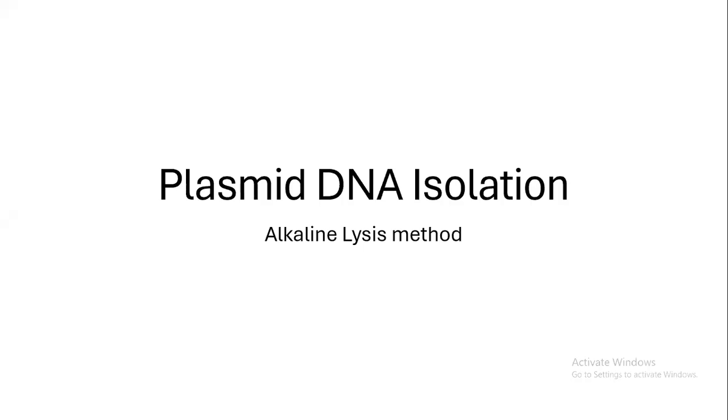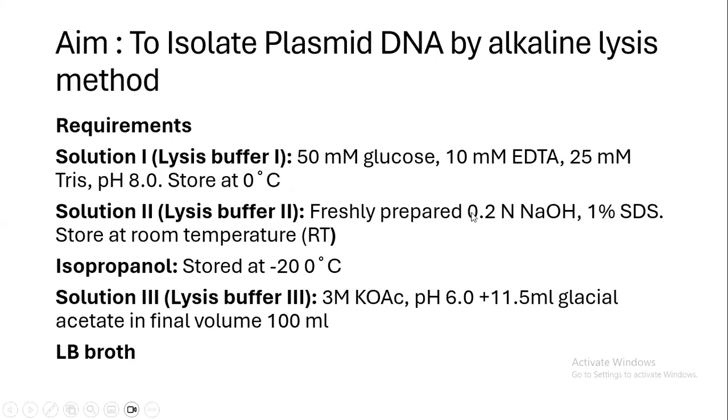Hello students, in today's lab we are going to learn about plasmid DNA isolation by alkaline lysis method. So the aim is to isolate plasmid DNA by alkaline lysis method.